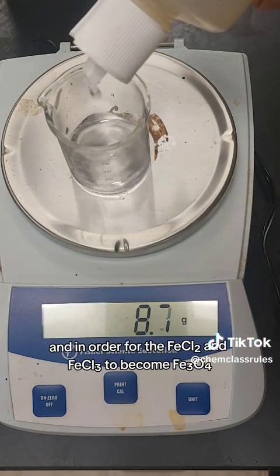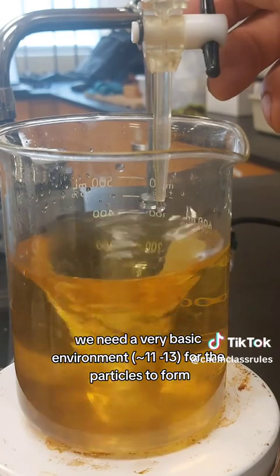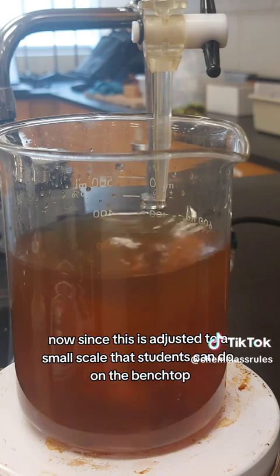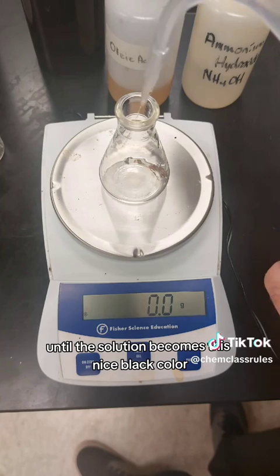In order for the iron(II) chloride and iron(III) chloride to become Fe3O4, we need a very basic environment for the particles to form. Since this is scaled for students to do on the bench top, we're using a burette to add our concentrated ammonium hydroxide until the solution becomes a nice black color.